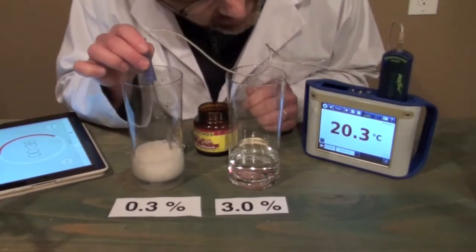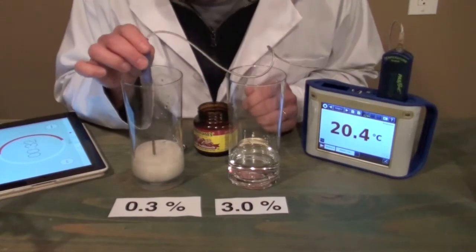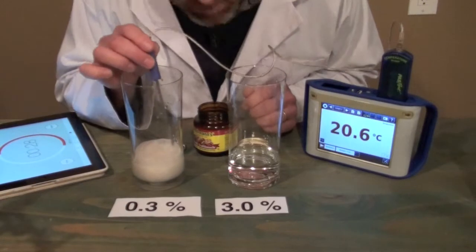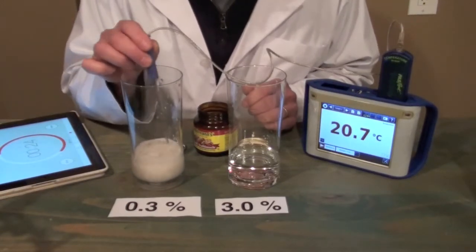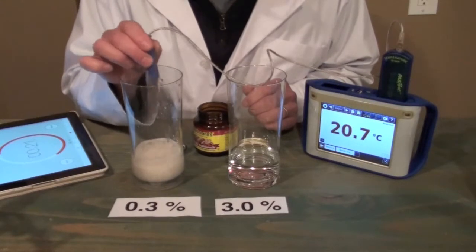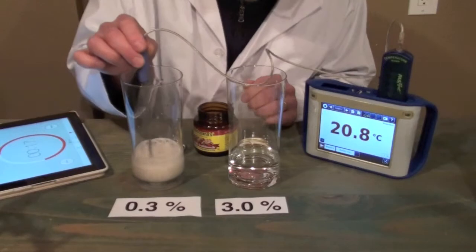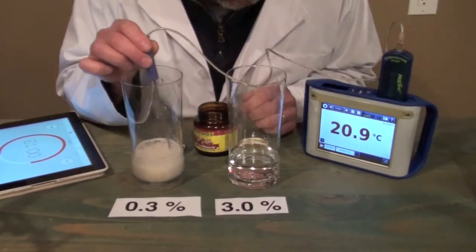We also have an increasing temperature. The temperature is now up to, looks like 20.5 degrees. Okay, we have 20 seconds left, and the temperature continues to rise, and we have probably about 2 centimeters of bubbling in the container.